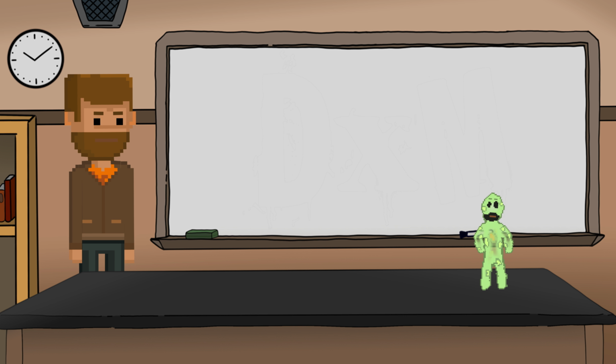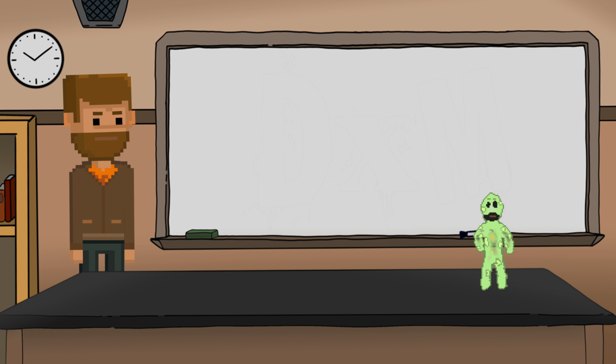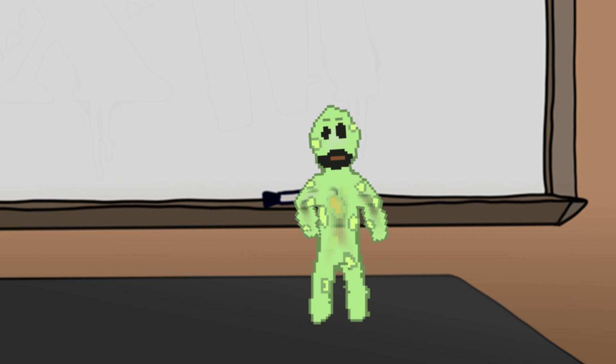Once you're done gram staining, focus on your flowchart. Depending on whether you answered yes or no, in this case positive or negative, to your stain, as well as yes or no to your shape, you will follow the logical set of tests until you conclude the identity of your unknown. You can only complete each test one at a time. You cannot do multiple tests as this will be wasteful and possibly dangerous.